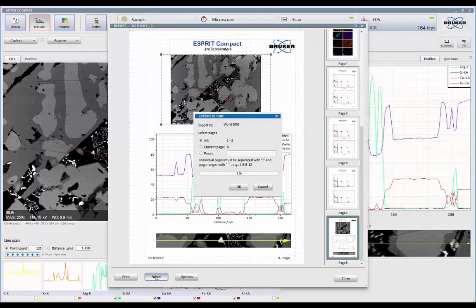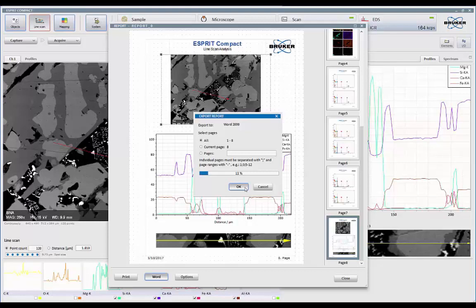So I can click on Word, click OK. And that will automatically transfer all this data to a Word document, if you have Word running on your system.